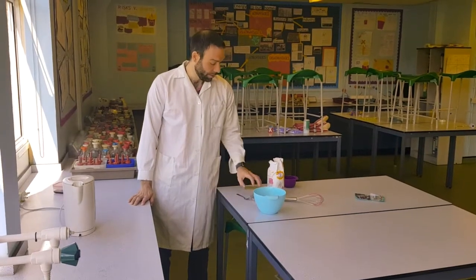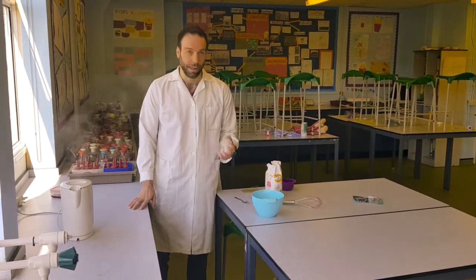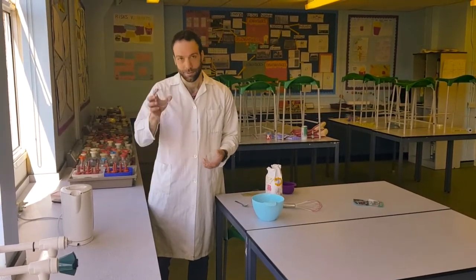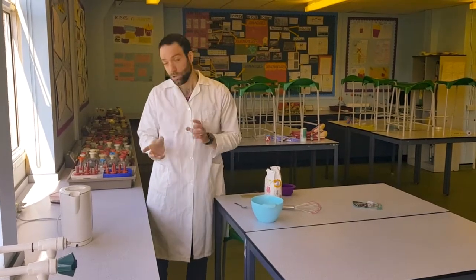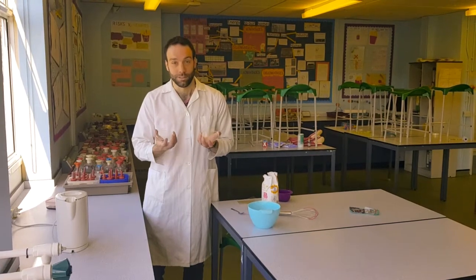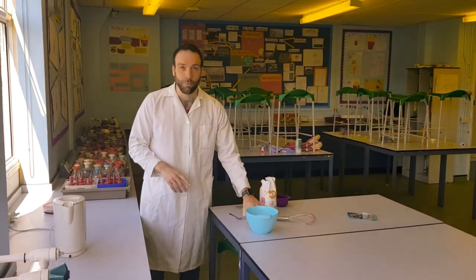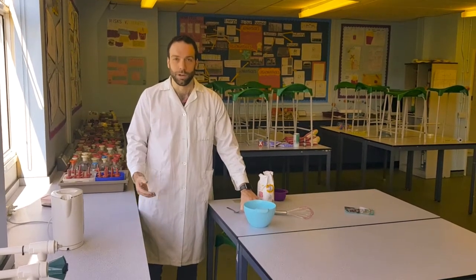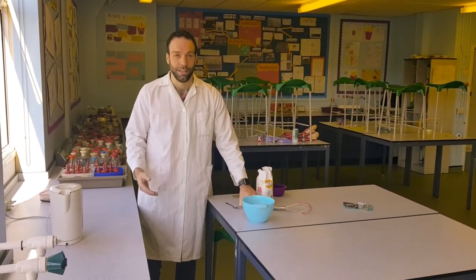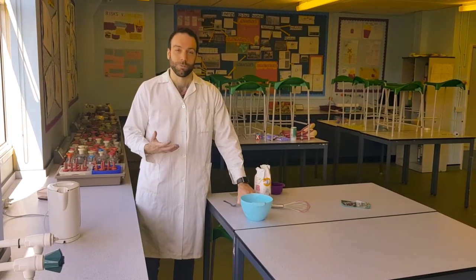In biology, what we're going to do is make some agar plates — the kind used for growing bacteria. You might have seen these in labs, but this is one you can do at home as long as you've got a suitable container. To grow bacteria, we make something they can grow on really well: a little jelly that contains all the nutrients they need and some sugar.